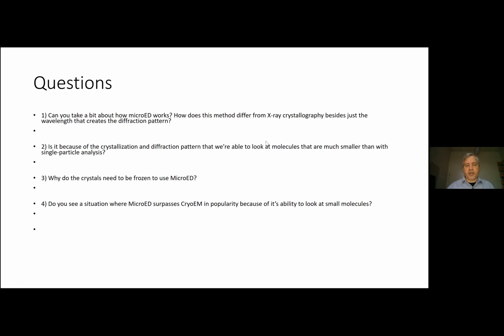Do I see a situation where MicroED surpasses Cryo-EM popularity? I don't know if MicroED will be as popular as Cryo-EM. I have a feeling Cryo-EM has become very popular because it's the single particles. I guess you mean single particle Cryo-EM. So the single particle Cryo-EM is popular really because it works very well. With MicroED, you then have the sort of what I'll call the pain of getting crystals again. So I don't think it's going to be as popular. I think it could be popular in some things where crystals of small molecules are easy to get or easier to get.